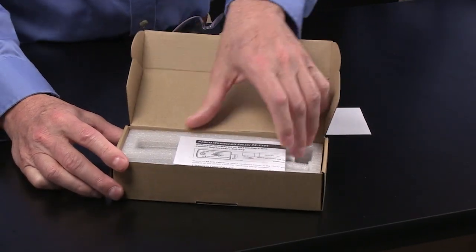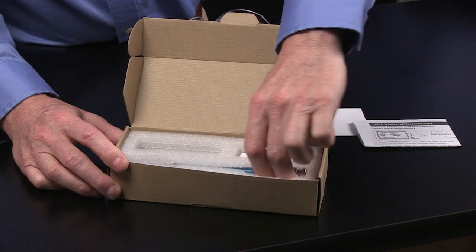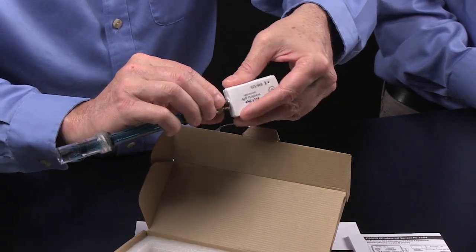What I'm going to do is show you how it comes out of the box and how to use it. First off, it comes in two pieces: the actual pH probe and the amplifier box. They connect with a BNC connection — very typical. You just turn it until it clicks. You could keep it like this or store them separately; personally, I just click it and leave it.